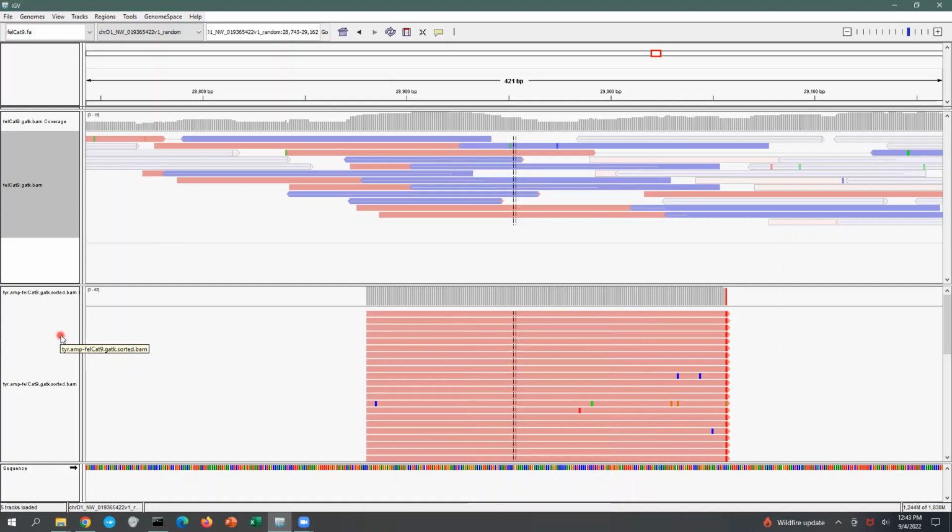So what I did is I took the text file of that intermediate data, I reformatted it, and I tried to process it in a way that's similar to the whole genome sequencing data. And there's only one color down here. A possibility is they have a strand-specific library so that next to the primers, you have the adapter sequence that could be directly sequenced, or it could just simply be that they wanted to make it easier to see the sequences. In a double-stranded, non-strand-specific library, you could in fact check variants on each strand against the reference genome, but this intermediate form data is all set to the same orientation. So that's why it's all pink.